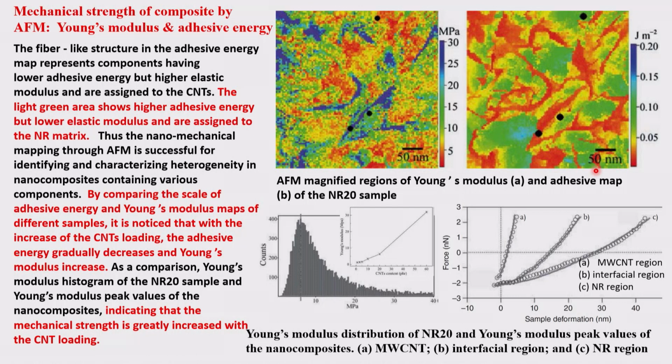Before we go to the other techniques, let us look at another example. We talked about the AFM being combined with a lot of engineering, particularly mechanical. I have not taken the example for conductive AFM, which is for charge conductance, etc., which mostly electrical people use. You can use that as an exercise I will give you. So here, this is the Young's modulus distribution.